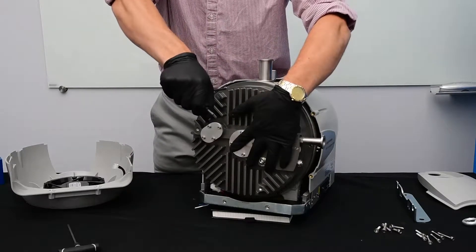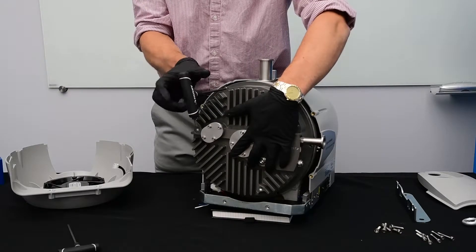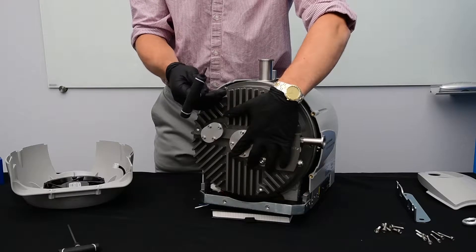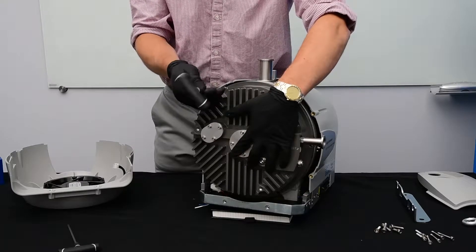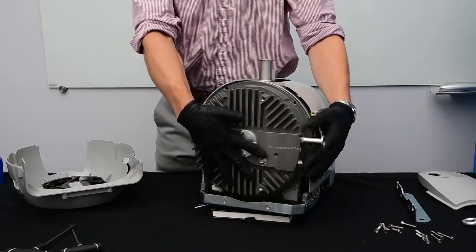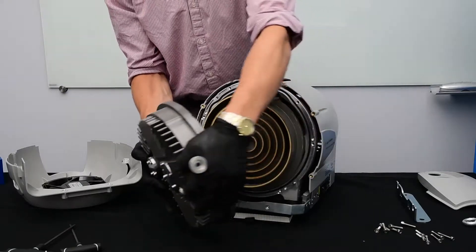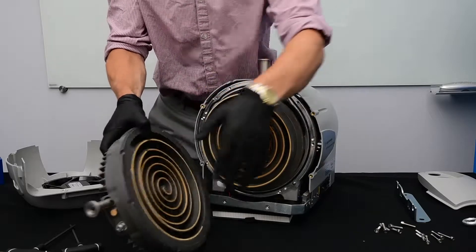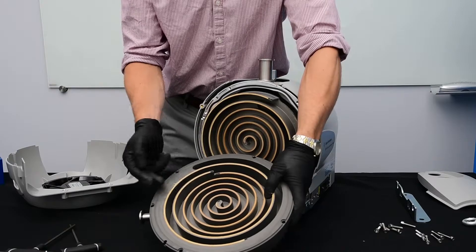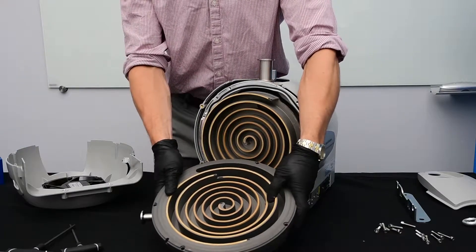Next, as I remove the last bolt, I'm going to support the outboard housing to make sure it doesn't fall. Now we can remove the outboard housing. We'll want to discard the tip seal as well as the o-ring as they will both be replaced in this tip seal change.